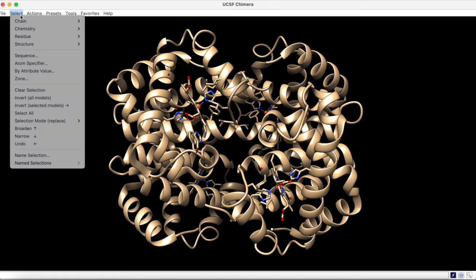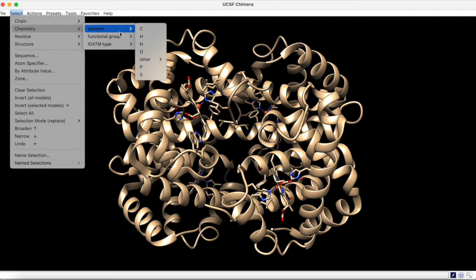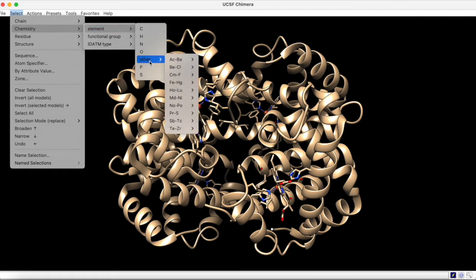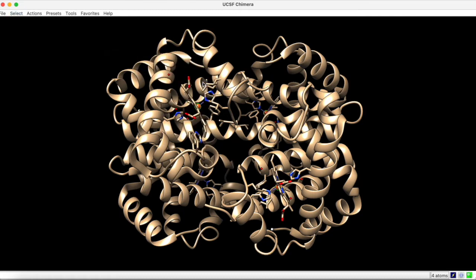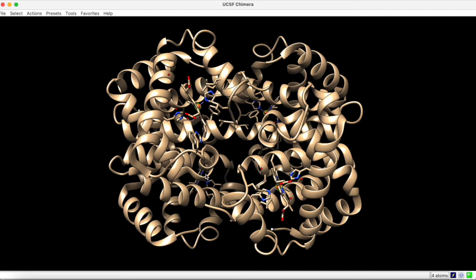Under Select, Chemistry, Element, and Other, we can locate the iron, Fe. Now, each of the iron ions is encircled by a green halo. The fourth one is hidden behind a ribbon.